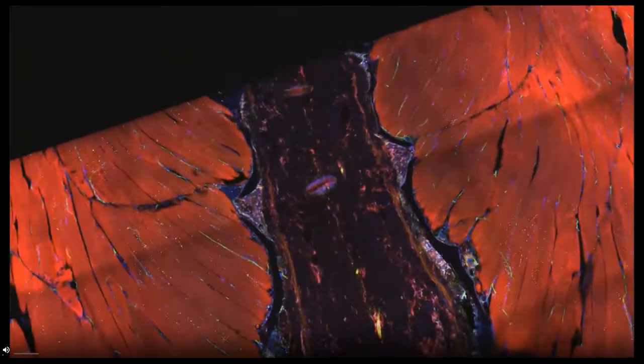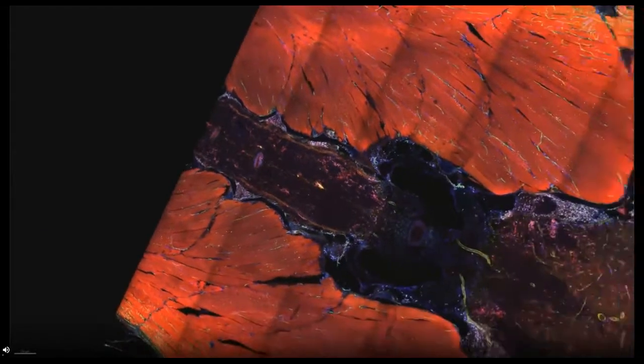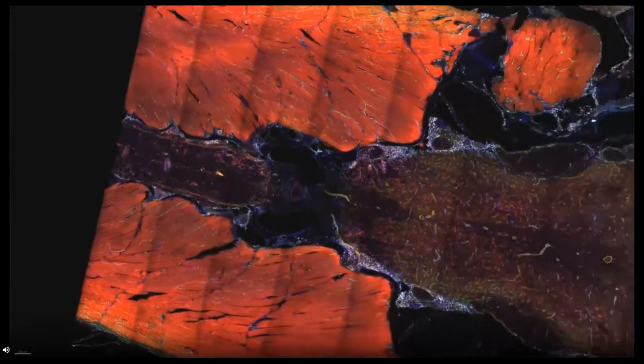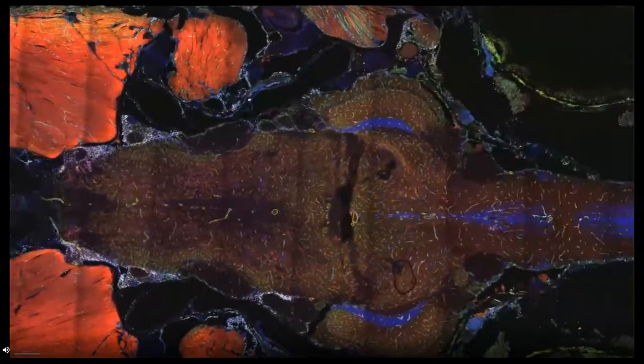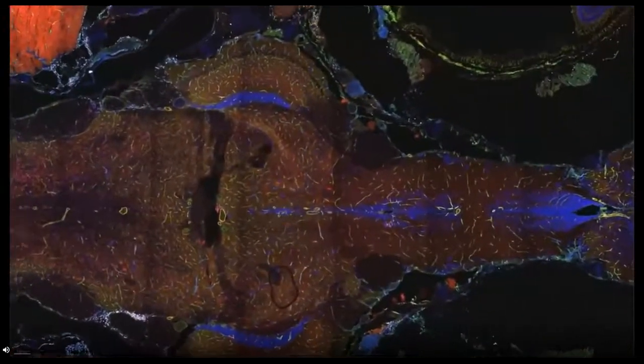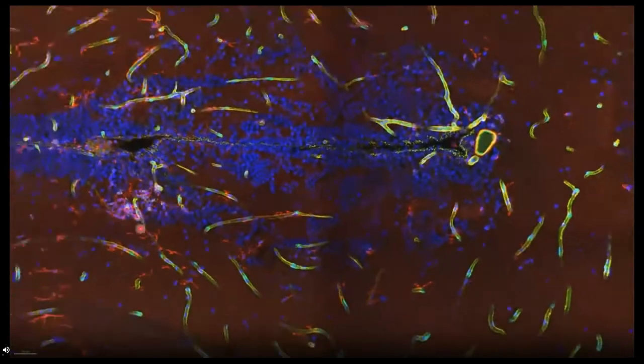So this really triggers infiltration of immune cells in the brain. You have to be careful when you do neuroscience to not have your fish infected with these parasites. We could also spot some local infiltrations of lymphocytes in the brain right here.